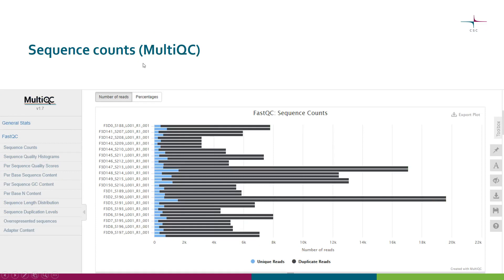Here we have another plot, the sequence count plot from MultiQC. On the x-axis we have the number of reads, and on the y-axis the different FASTQ files. As you can see, some samples have lots of reads — almost 20,000 — while for others we have fewer than 4,000. MultiQC also color-codes these bars showing how many reads are unique and how many are duplicates, meaning identical reads within a particular file. On the right-hand side you can see the toolbox — clicking it gives you a menu with many options.